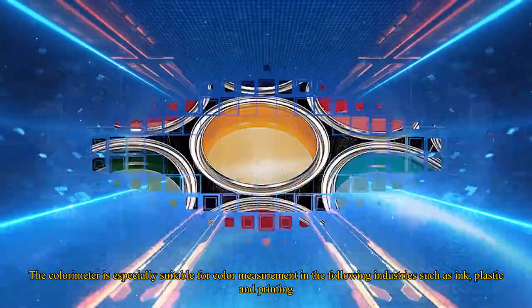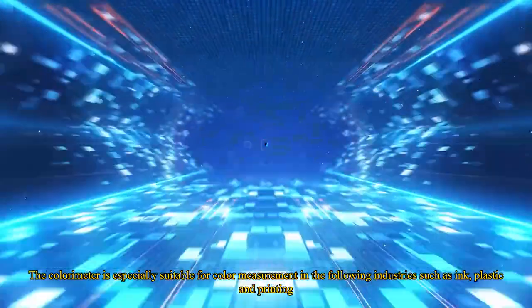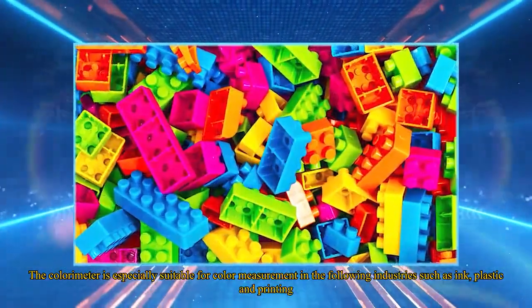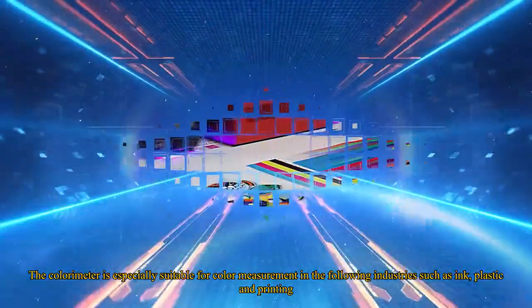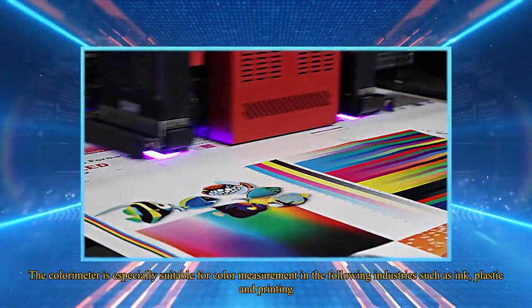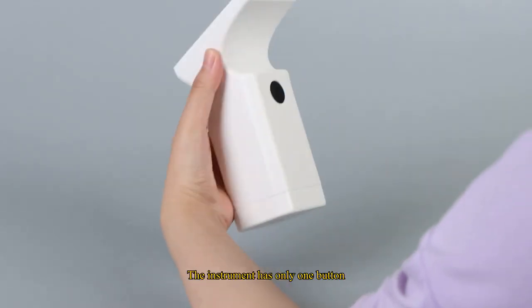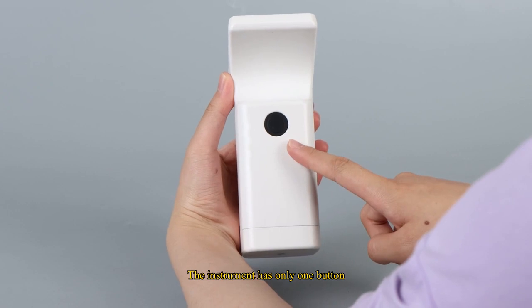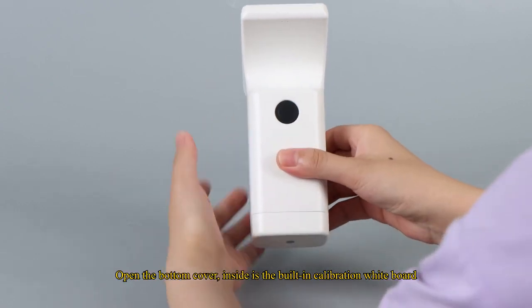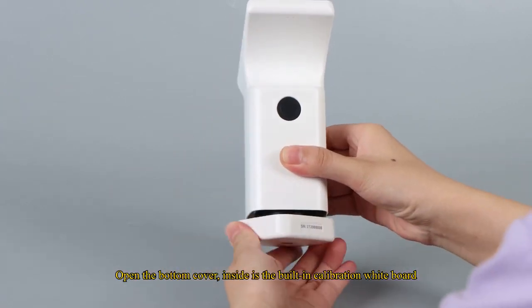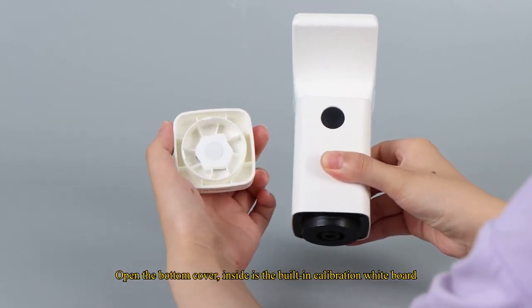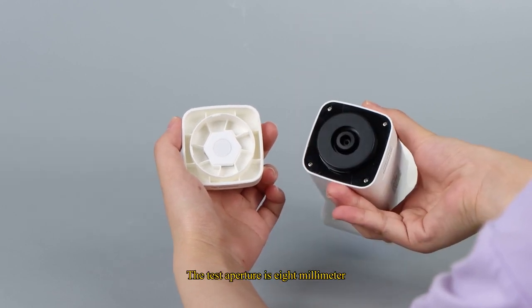The colorimeter is especially suitable for color measurement in the following industries such as ink, plastic, and printing. The instrument has only one button. Open the bottom cover, inside is the built-in calibration whiteboard. The test aperture is 8mm.